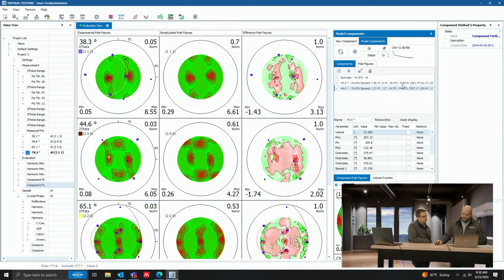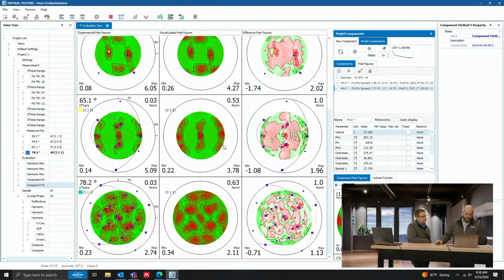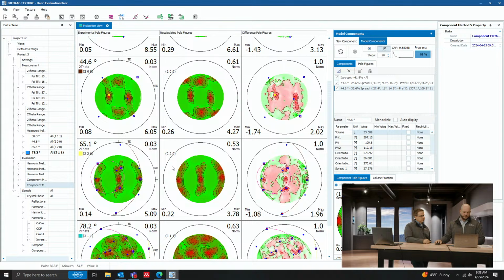And you can see the phi 1, phi 2 values are slightly different, so they could be different components, actually. So, yeah, I mean, this definitely looks like I only have 2 components now, and I have a much better fit. Versus the 4 that you had to use previously using a spherical. Yeah, and that actually plays out in that chi-square value. It was 0.8 before, now 0.58. Yep, exactly. So I can refine that again if I want. I could add more components to refine that chi-squared value, even make it look even better. But at this point, I think this is pretty reasonable.